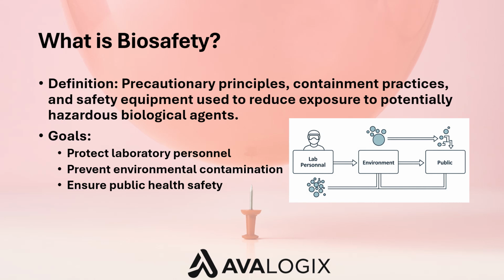What exactly is biosafety? At its core, biosafety involves the application of a set of containment principles, laboratory practices, and safety equipment aimed at preventing unintentional exposure to pathogens and toxins, or their accidental release into the environment. The purpose of biosafety isn't only to protect the individual working in the lab, although that's certainly a big part of it. It's also to protect the environment and the general public from potential exposure.